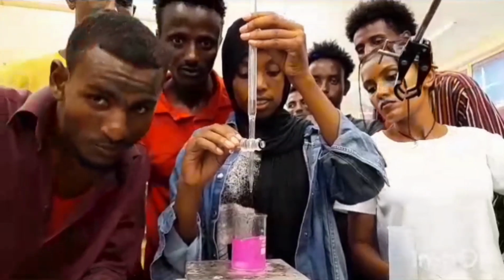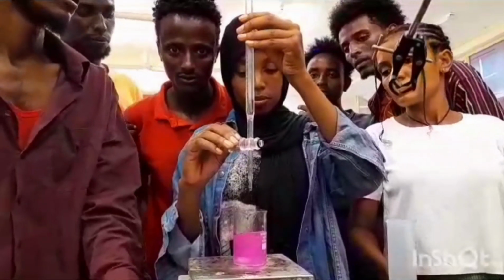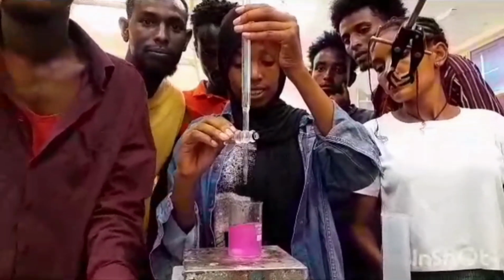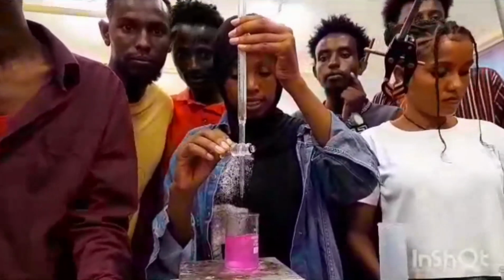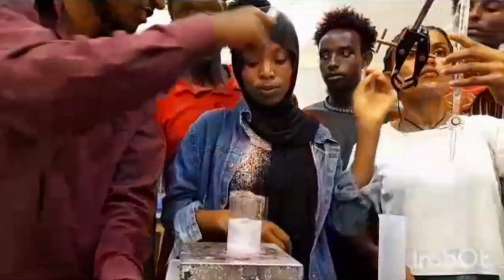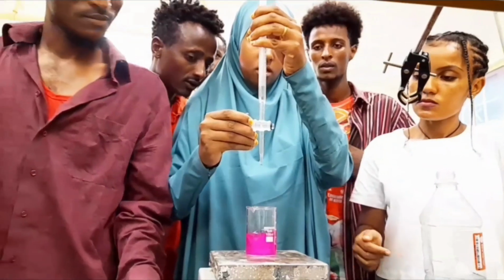Neutralizes, the pink color changes to colorless. Slowly you can see the color change. Pink color is converting into colorless. Still the reaction is going on. Sodium hydroxide is there in the beaker. Now if you slowly add the hydrochloric acid, you can observe the color change. All of you, did you observe the color change? Yes. See, stop the reaction. So the pink color changes to colorless. That is the end of the reaction.